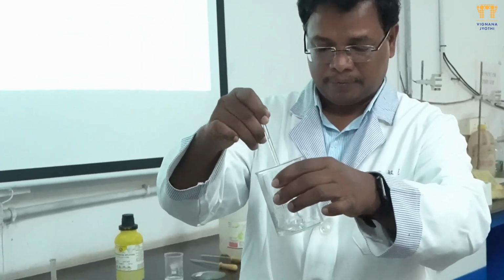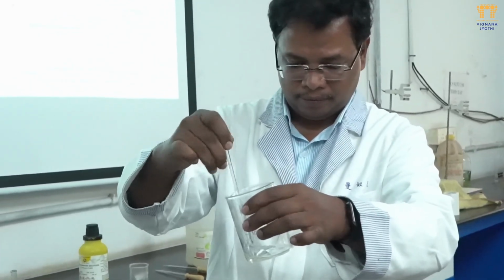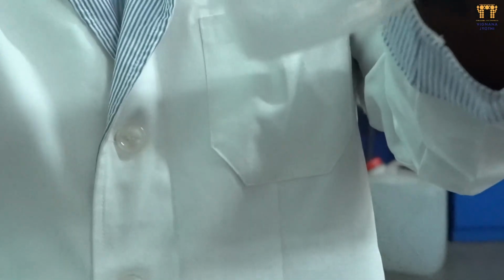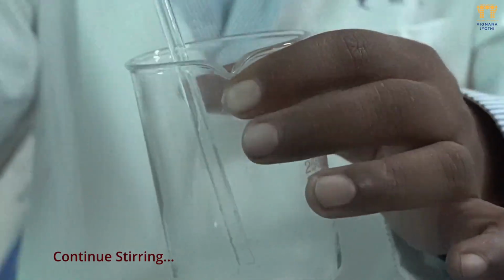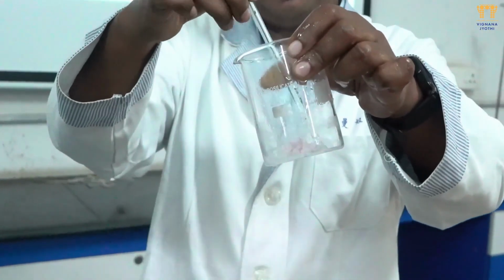Stirring the mixture properly, the reaction mixture is now going to make a Novolac polymer, a linear polymer. Initially it will become Novolac, a linear product, and then finally it will become bakelite by adding the curing agent hexamine.